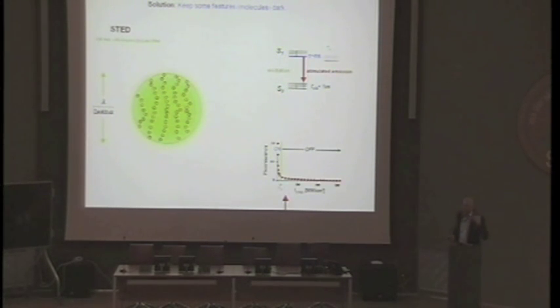Now, if you're trained as a physicist, and you think, oh, how can I do that? The first thing that comes into your mind, if you think about a problem in that way, is to use a very basic phenomenon, which is called stimulated emission. By the way, this phenomenon is used now for pointing here the beam onto the screen, but that's a different story. It's a very basic phenomenon. What does this mean? Usually molecules are excited from the ground state to the excited state because they are in the ground state. This is the only reason. Usually they are at room temperature in the ground state.